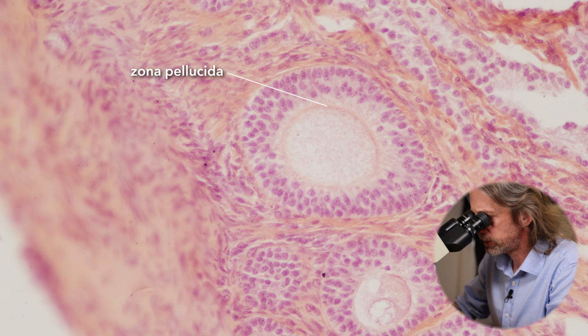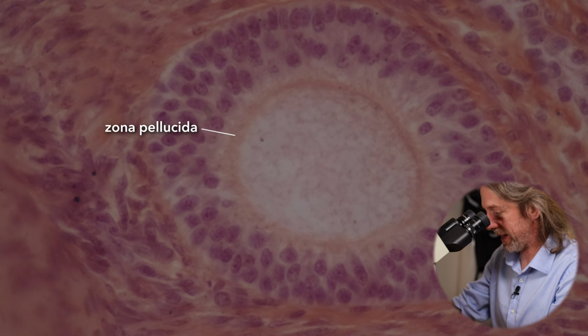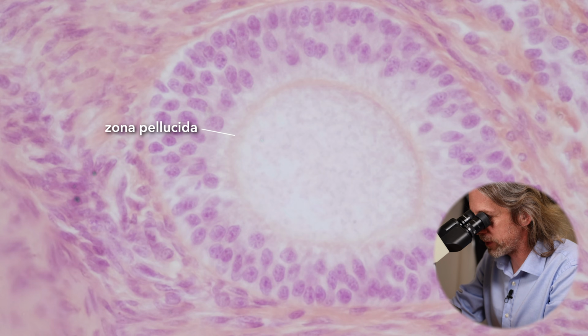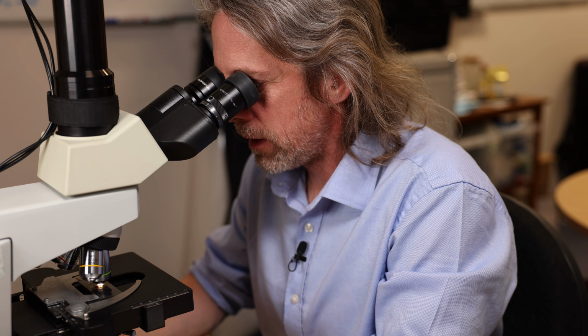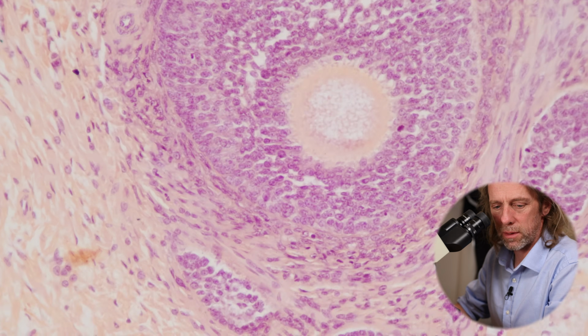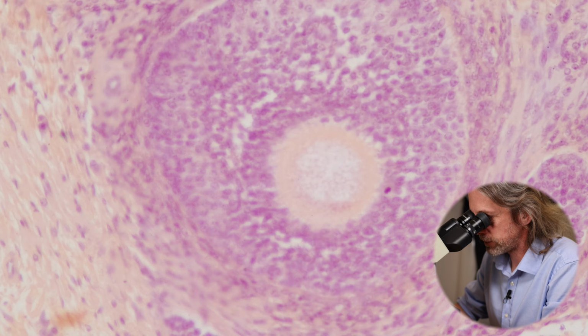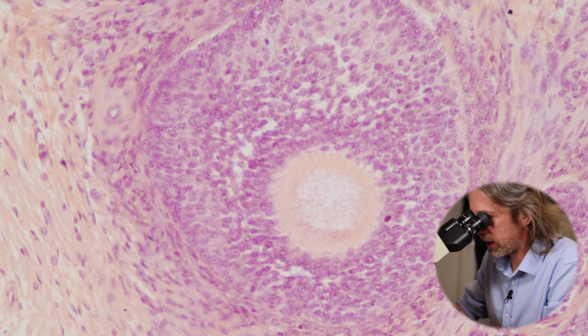And that develops. The primary follicle is going to become a secondary follicle. Okay, that's pretty good. Can you see there's the oocyte in the middle, and it's got a yellow ring round it, so it's now surrounded by the zona pellucida that's formed.